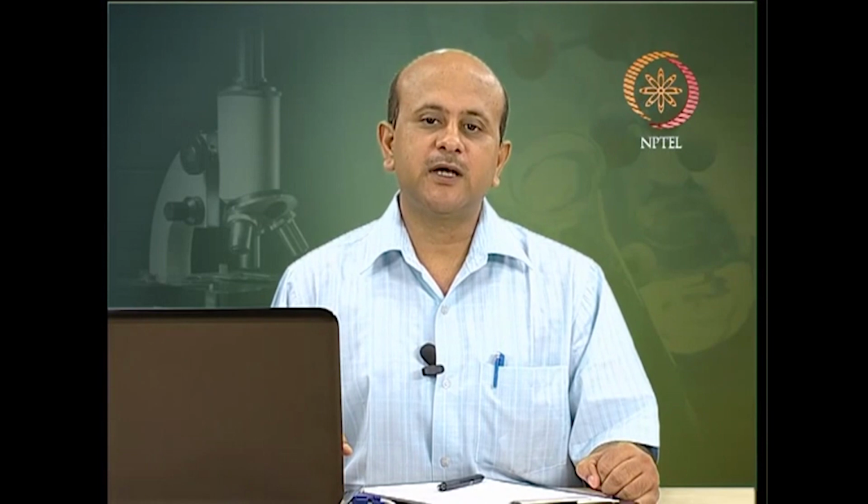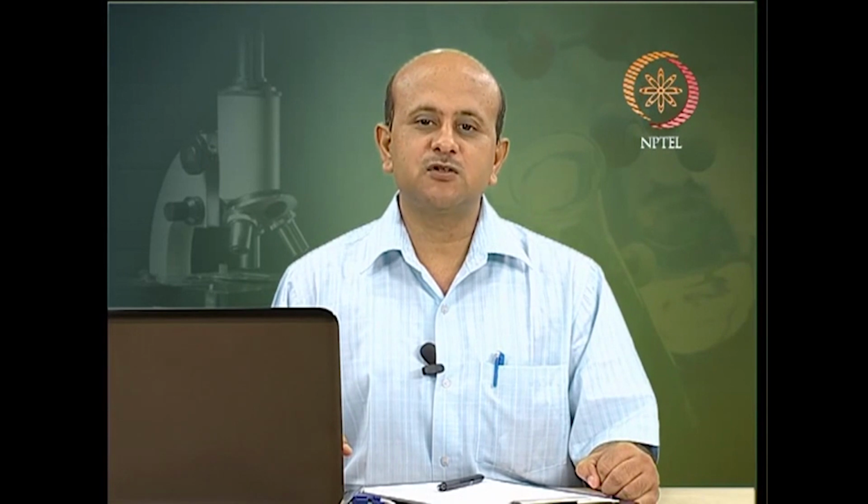between the two, that is a quarter wavelength phase difference between them. CD is observed when optically active matter absorbs left and right circularly polarized light differentially, or slightly differently, and this absorption is quantified by a term known as the molar extinction coefficient. Optically active samples have distinct molar extinction coefficients for left and right circularly polarized light.